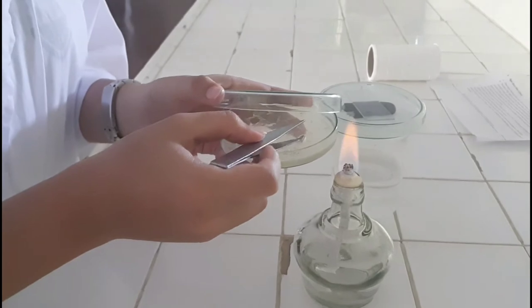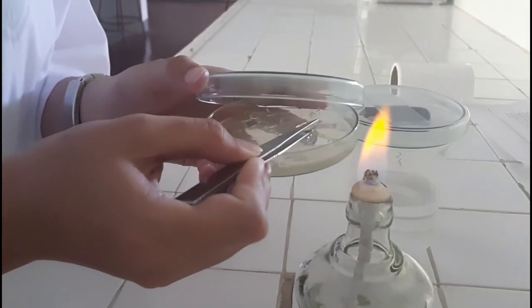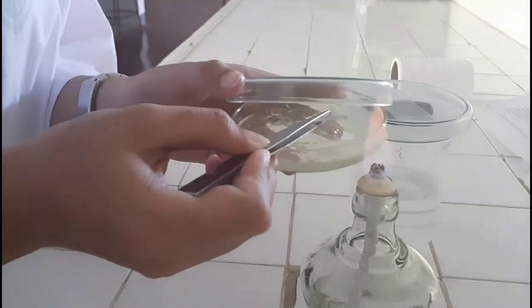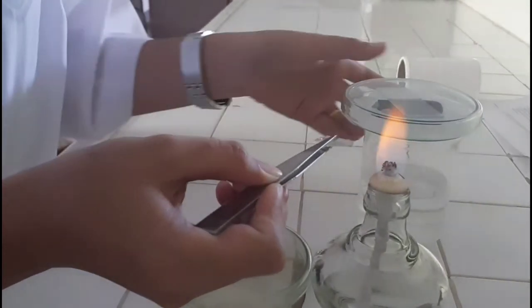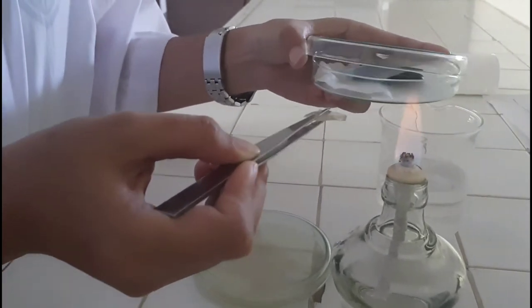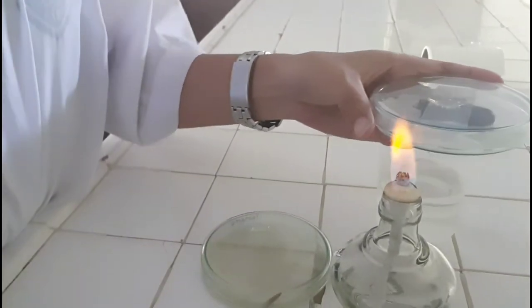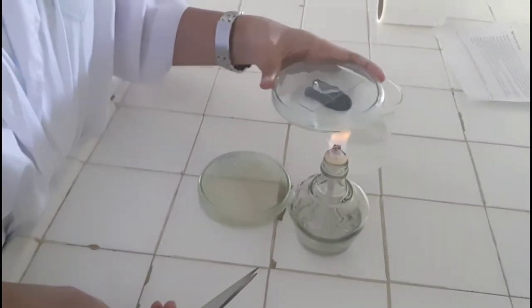Using tweezer, mount the square block on the middle of the clean and sterilized glass slide. Don't forget to keep it near the alcohol lamp to avoid contaminants. Reflame and set aside.